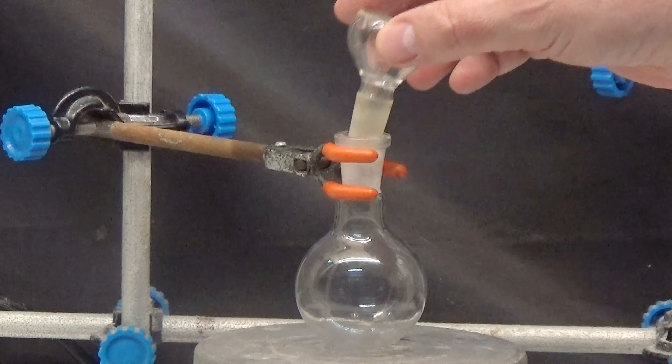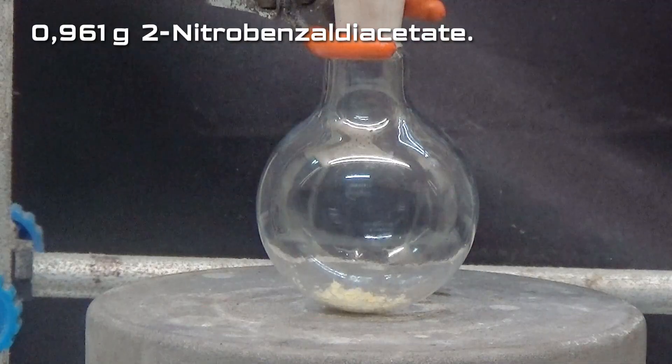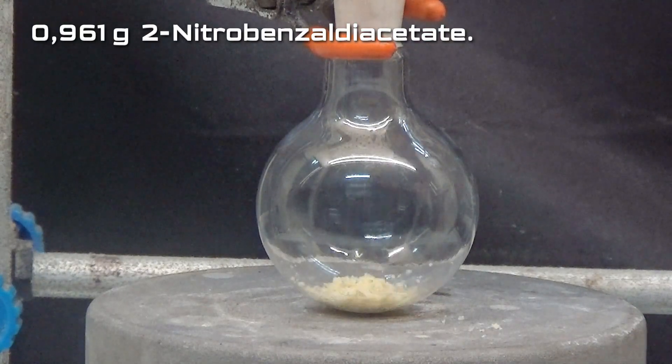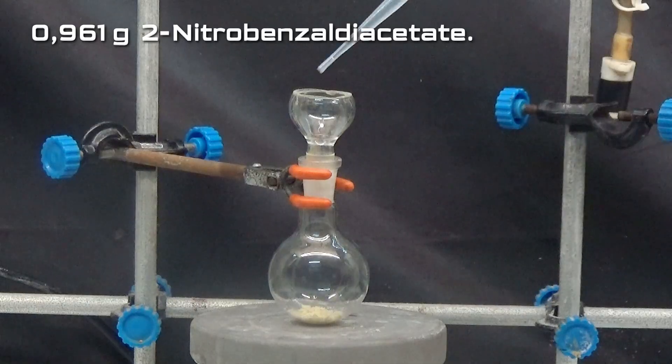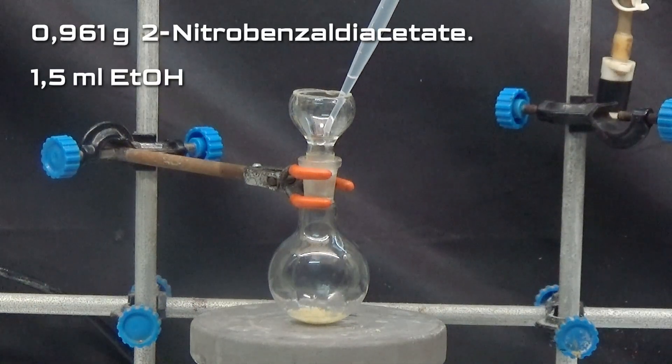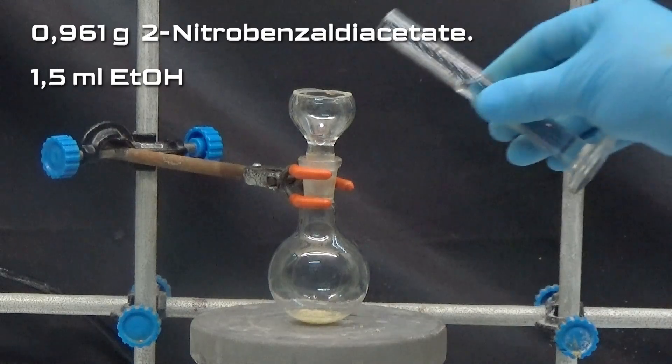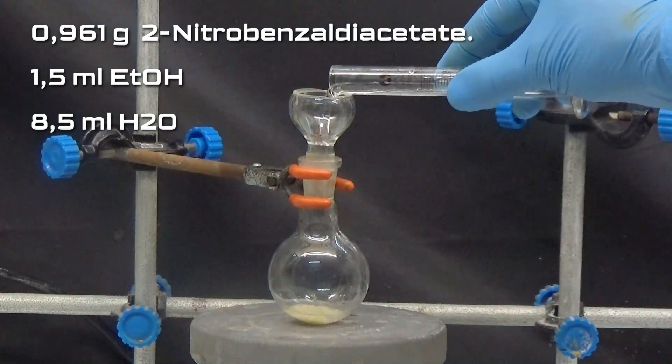In the second part of the synthesis we put the 0.961g of product obtained in the previous operation in a 50ml flask and add 1.5ml of ethanol, 8.5ml of water and 5ml of concentrated hydrochloric acid.